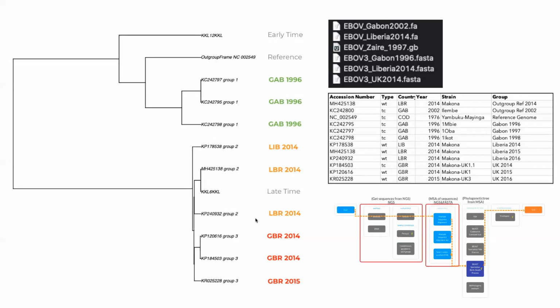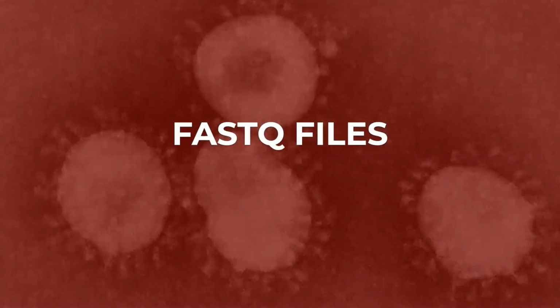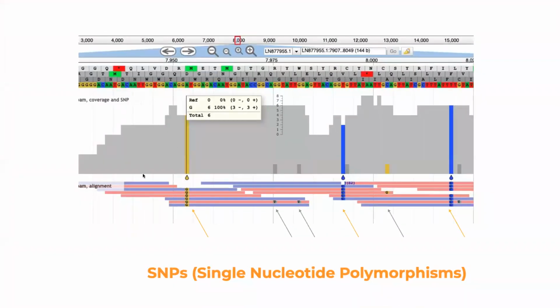So another type of data that was for FASTA files, right? Another type of data that you could have from next generation sequencing, in fact, that is typically coming out of a next generation sequencer, is actually a FASTQ file. The FASTQ file contains reads, and those reads are stacked up in different positions on the genome, and those actually help us understand the variation as it really happens in a sample. So when we have a collection of reads, we can analyze those reads for similarity, and if we find a position that has a consistent change from the reference genome, we can start looking for those variants.